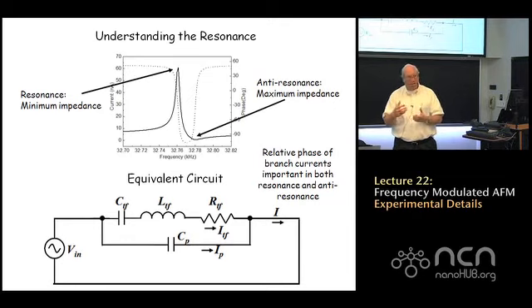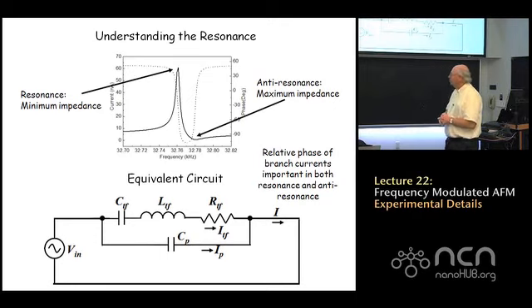Here, all you have to do is put the tuning fork inside of a holder, insert the holder into a vacuum chamber. You're going to need 2 electrodes, two wires coming out, right? So you eliminate all the hassle with lasers to pull this off.